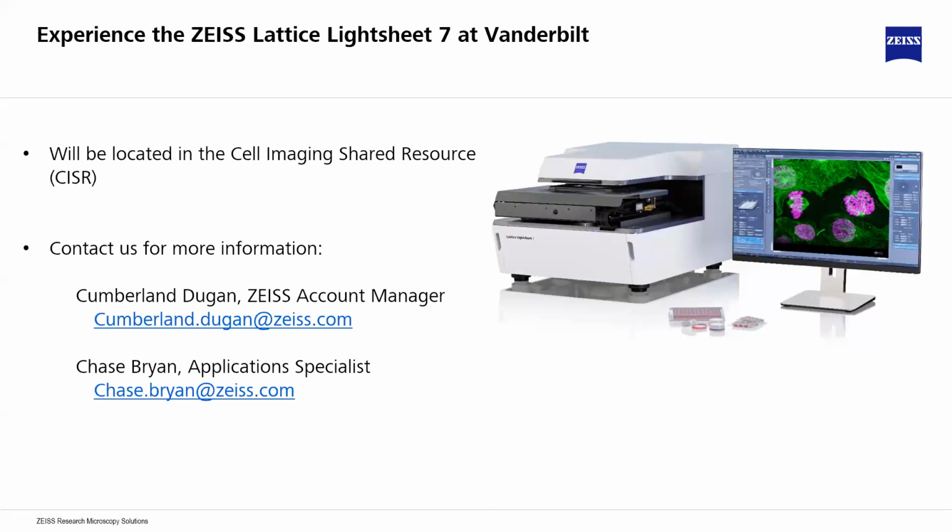So the system that will be on campus is equipped with 2 Hamamatsu Fusions. These are really sensitive, high quantum efficiency cameras. These are state-of-the-art Hamamatsus. sCMOS, I believe. Yes, sCMOS. Correct me if I'm wrong on that, Cumberland. I think they're sCMOS. These are not the back-thinned Fusions, no.